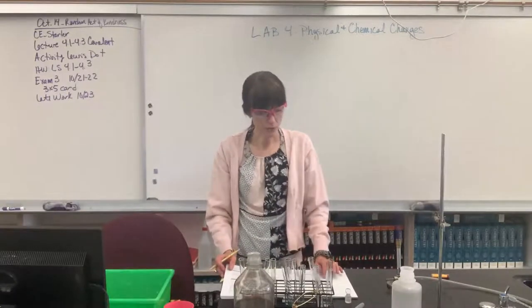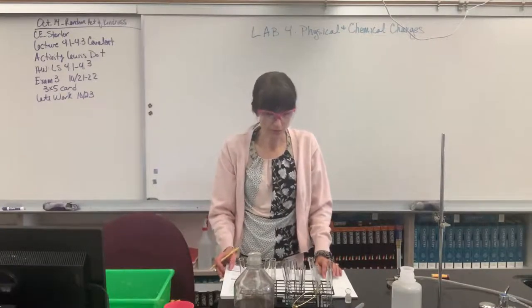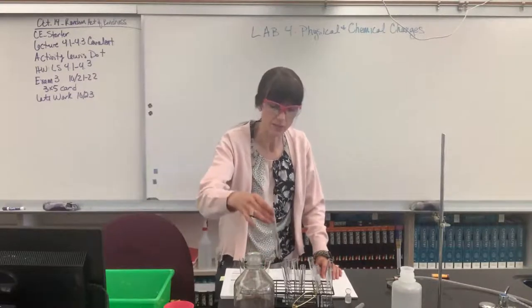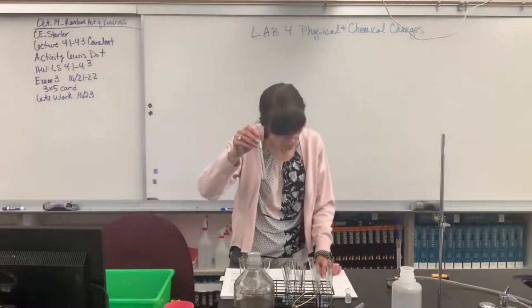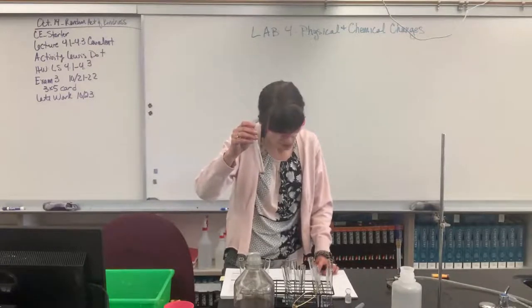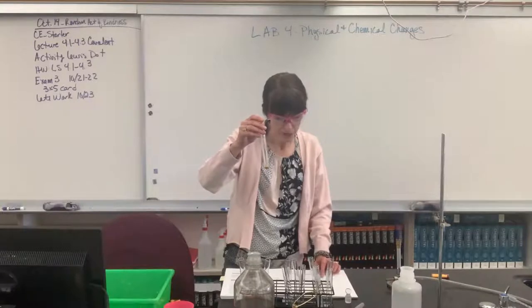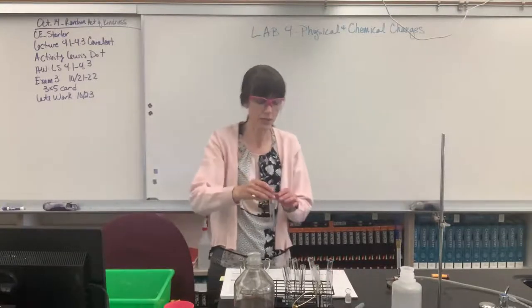We have to let this cool. I'm on part C, step 8. It said allow the melted sample to cool for 5 minutes. Let me make sure it's cool. Okay, this is my melted sample. The test tube's cool. All right. So it's cooled. The sample might remain as a liquid. It is still a liquid. It's cooled, but it is a liquid. It's not a solid. You may need to change the sample by melting it and letting it cool. It says add 30 drops of distilled water to the cool sample and shake until the sample dissolves completely.